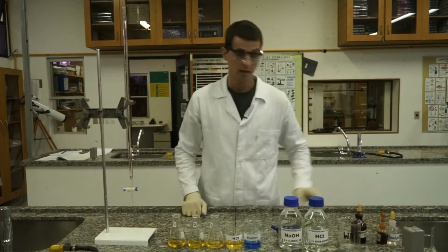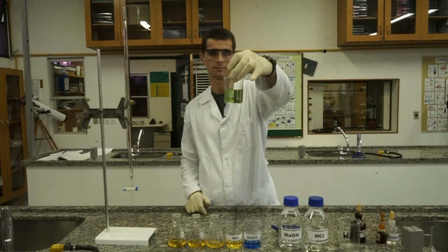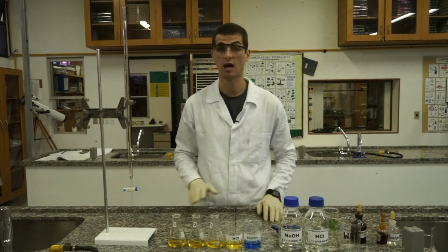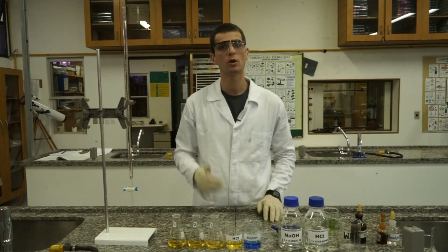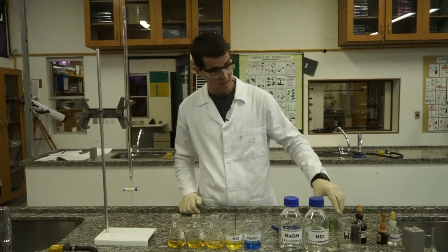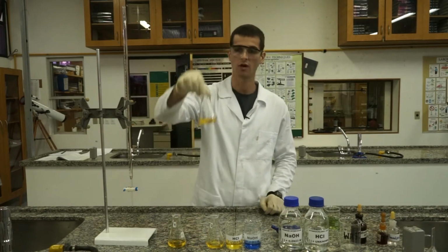But guys, in this case, the color we crave is green. This green right here. Look. The green color will indicate the end point of my titration and also will indicate that the pH will be close to 7. That is neutral. It gives me the certainty that the number of moles of my titrant is the same as the number of moles of my ANALYTE.